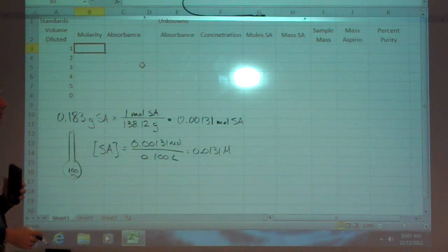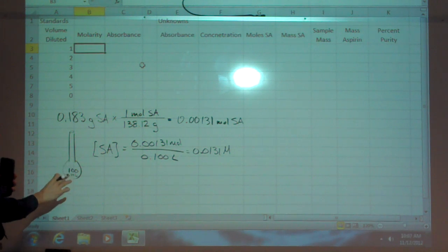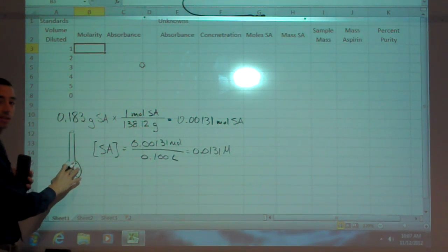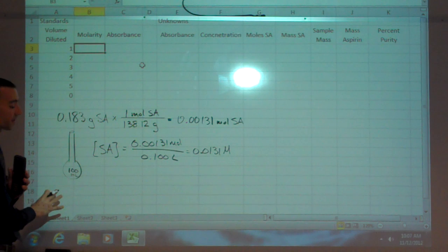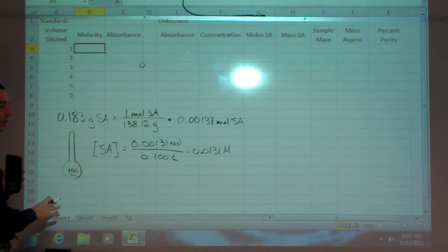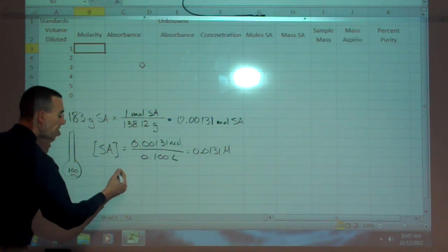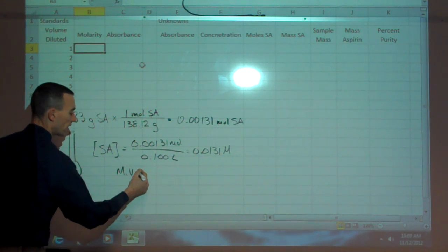We then took 1, 2, 3, 4, and 5 milliliter samples, respectively, out of this stock solution, as we often call it, the stock supply, and repeatedly dissolved or diluted each of those into a new 50 milliliter container. So that is the dilution rule.